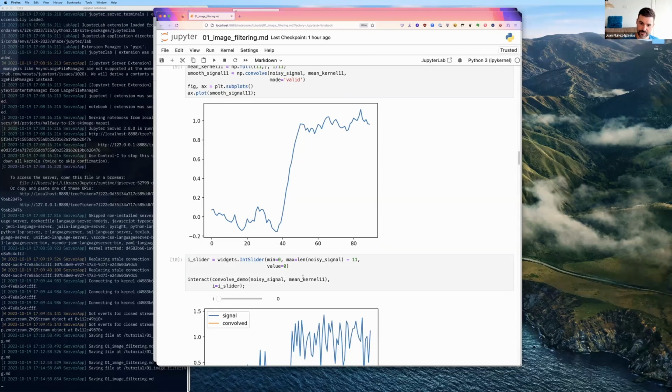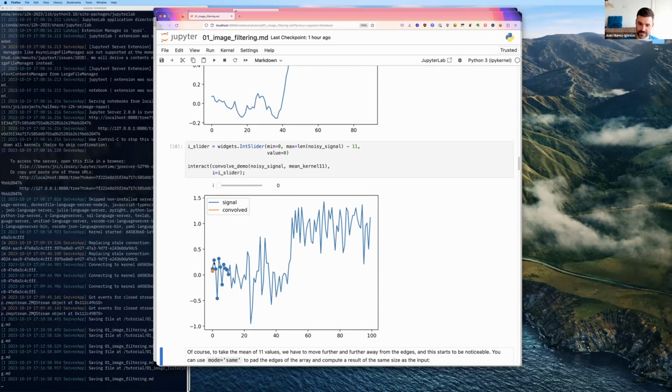And again, we can do the same thing as before. You can see these are the 11 values at the start, and then this is the average of those values. And you can see now, because you're taking many more values, these 2 points don't really have much weight, and the mean is close to all of the other values. So that's how you get more smoothing.